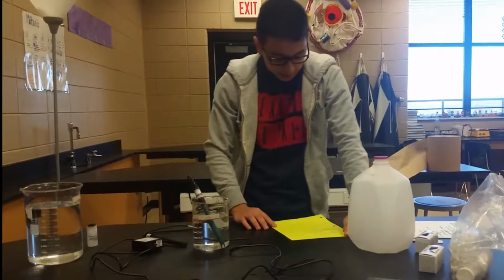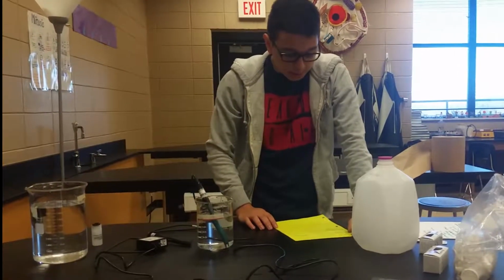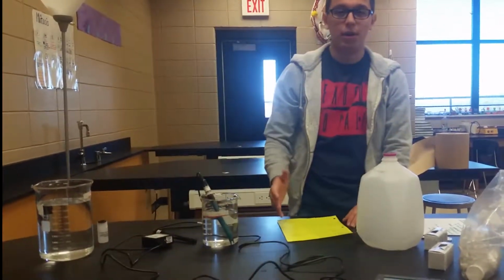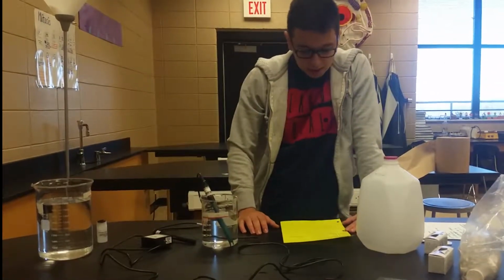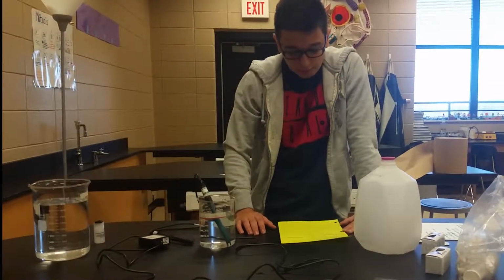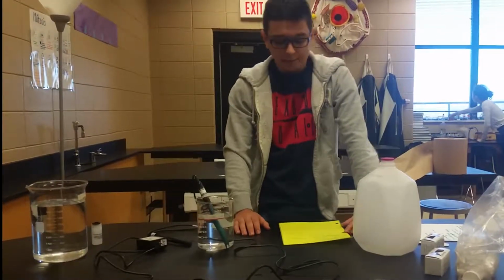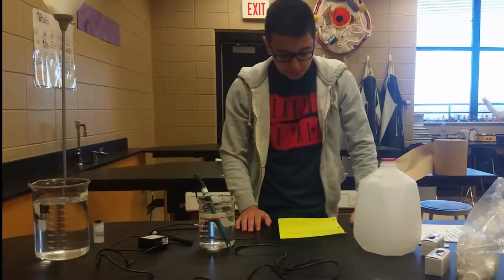And the highest that we have on here, I believe it was 6.8 from Brookwood, which is actually pretty good because it's very neutral. The lowest was Westwood at a 5.4. That's not really good because that means the water over there was really acidic. So just a heads up to that. Yeah, and that's all I got for you today.